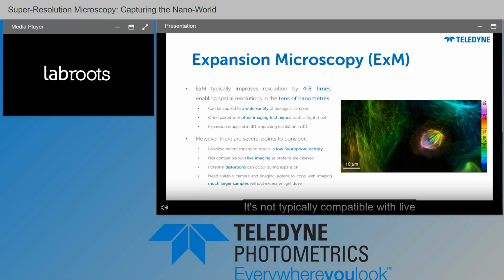It's not typically compatible with live imaging because in order for the cell to expand, you have to cleave the proteins, and the cell has to be embedded in a gel and physically swollen up, so it's not as relevant to live cells. There are also potential distortions that can occur during expansion if your sample expands more in one direction than another.